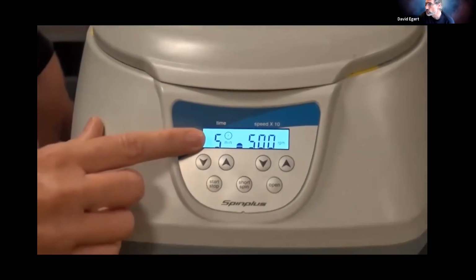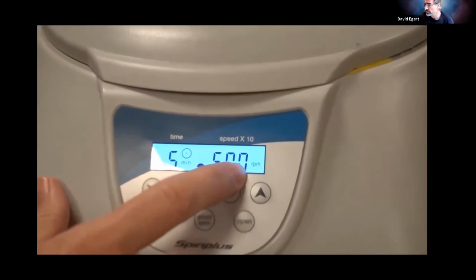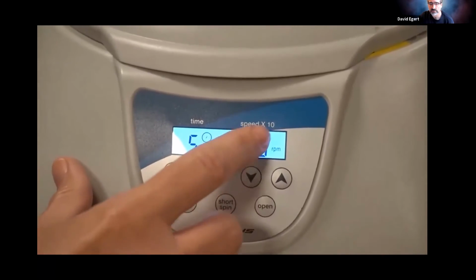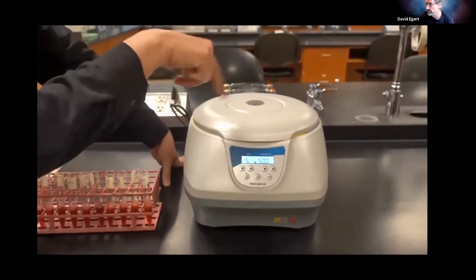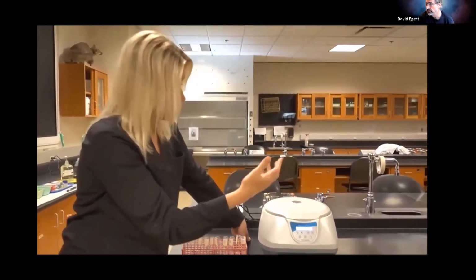So we're going to spin these for 5 minutes at 5,000 RPM. You might go, well, it's only saying 500, but if you look up here, it says times 10. So 500 times 10 is 5,000, so this is good to go. RPM means revolutions per minute. So that means that it's spinning 5,000 times per minute. That's quite amazing.